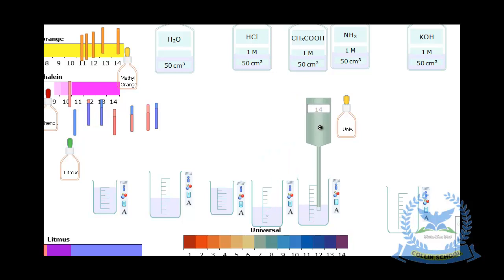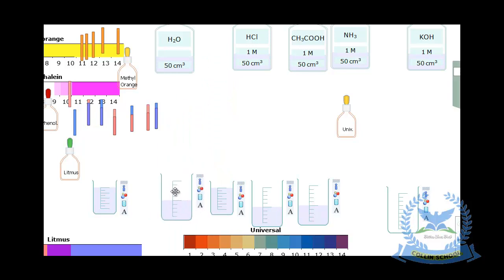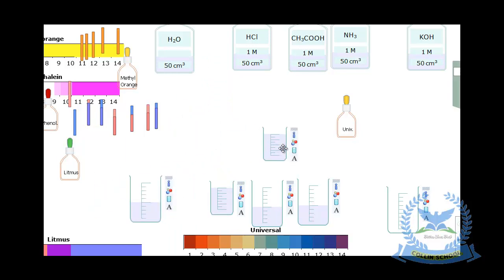So this 14 is a strong base, 11 is a weak base. Then let's go to this. 2.38 tells us that this should be a strong acid. It should be strongly acidic. But let's see the others.